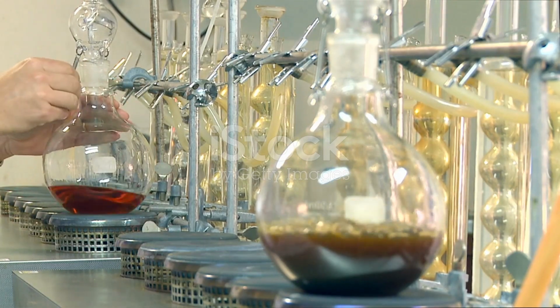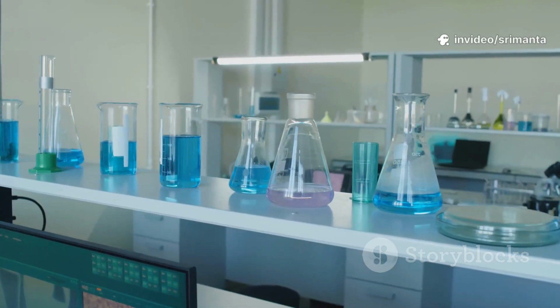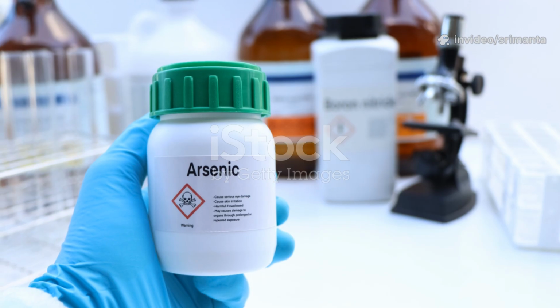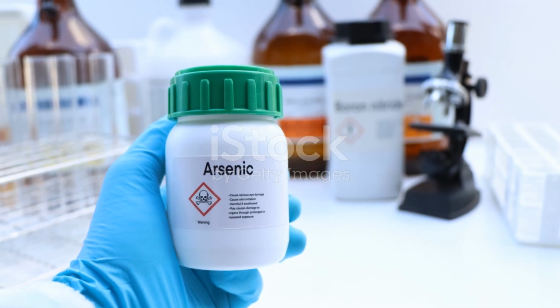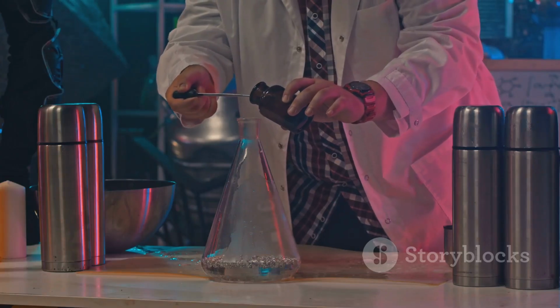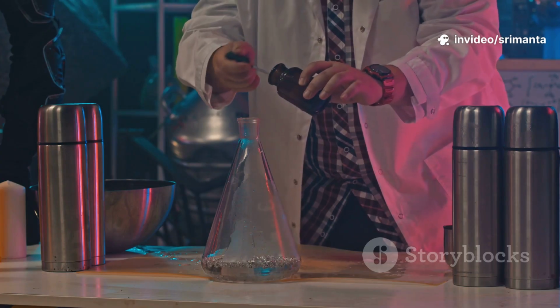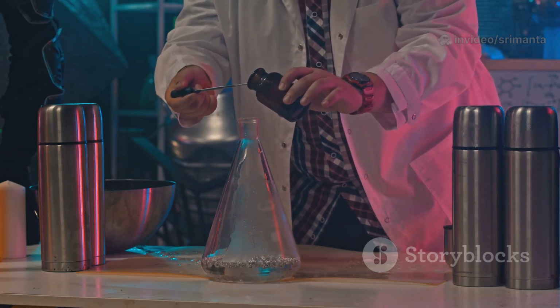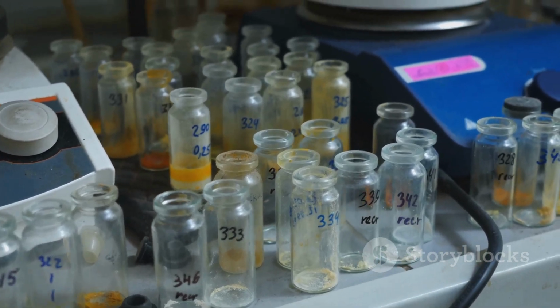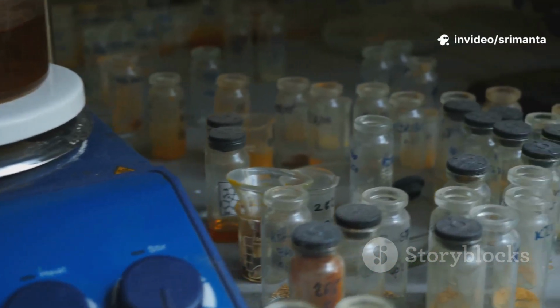Let's get into the nitty-gritty of the chemistry. Consider this. The principle of the test is based on a series of chemical reactions. The first step is to make sure any arsenic in our sample is in the right form. Arsenic can exist in different chemical states, but for this test, we need it to be in its arsenious acid form. So the first thing we do is react our sample with acids. This process, often helped by other chemicals like potassium iodide, converts all the arsenic compounds into a form that is ready for the next big step. It is like getting all your ingredients prepped before you start cooking. Every chemical has a very specific job to do in this scientific recipe.